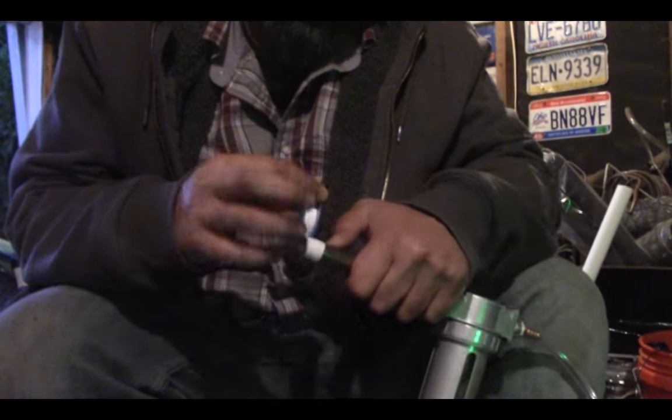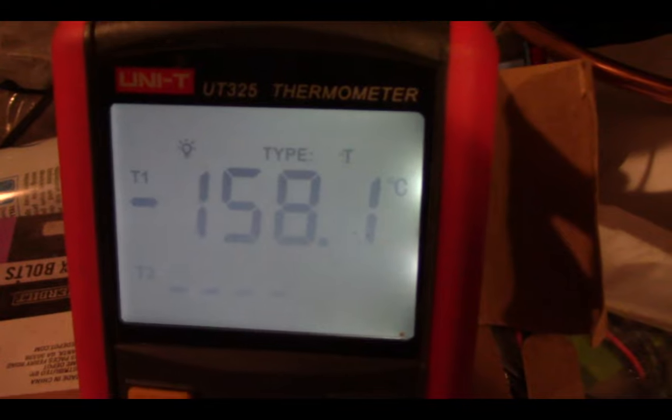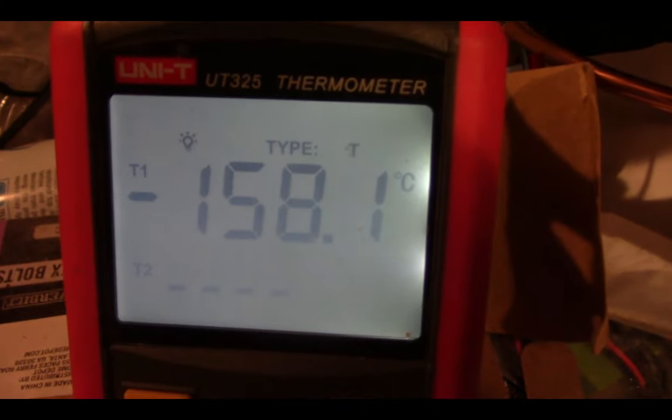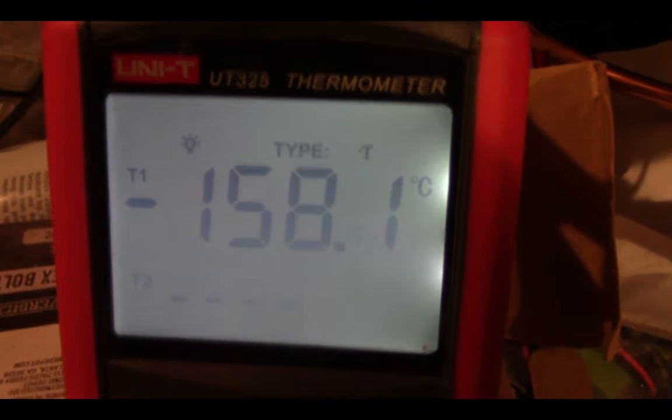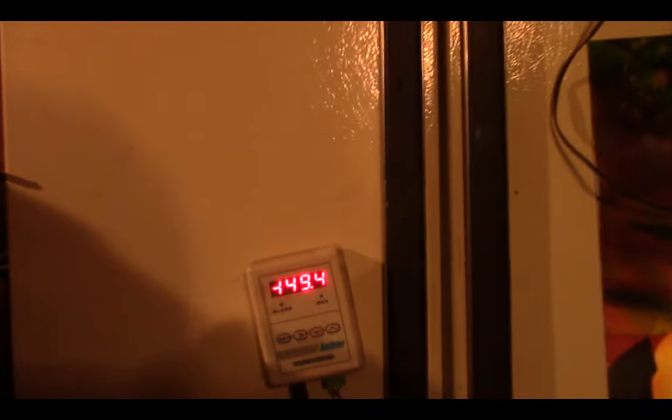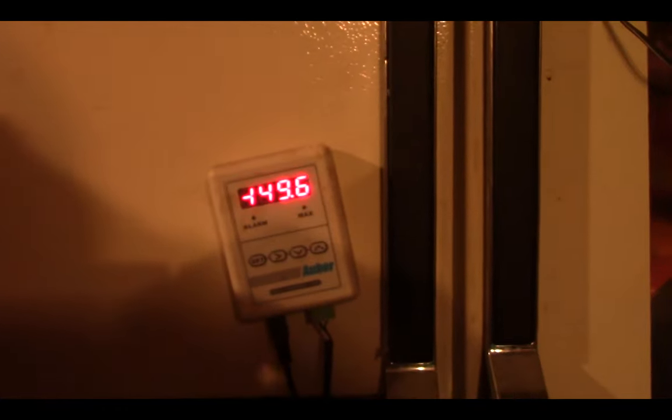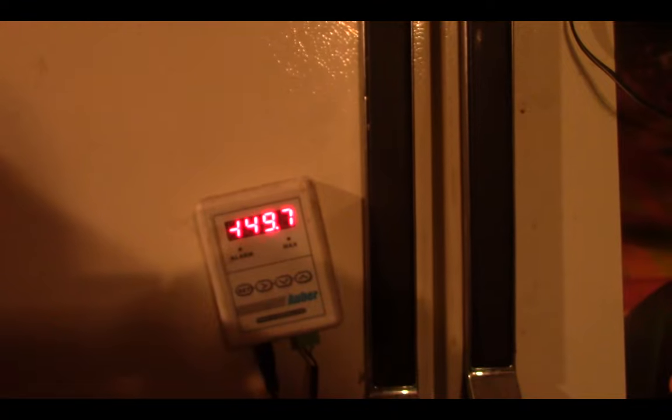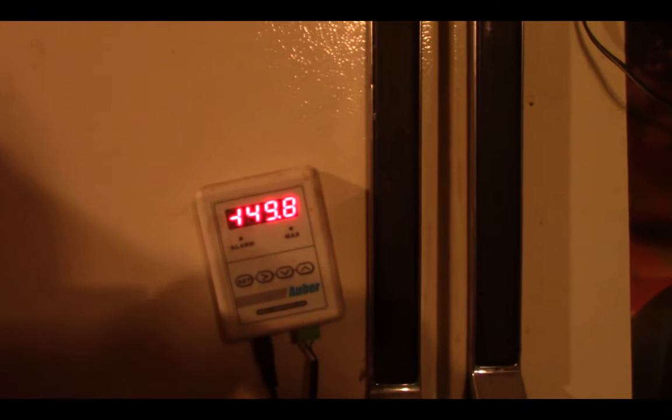But cooling 1000 cubic meters down to 100 degrees below zero to collect barely one milliliter of xenon is not something I have the time to monitor, and my light bill might take a significant hit.